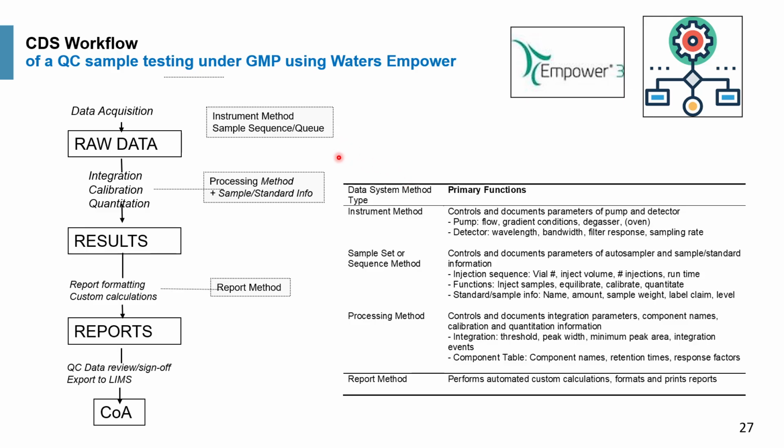So it's pretty detailed. You go from the raw data, after integration, calibration, quantitation, you get a result file, and that eventually, with the right report, becomes an actual report, which eventually can wind up as released QC data in the form of a certificate of analysis.